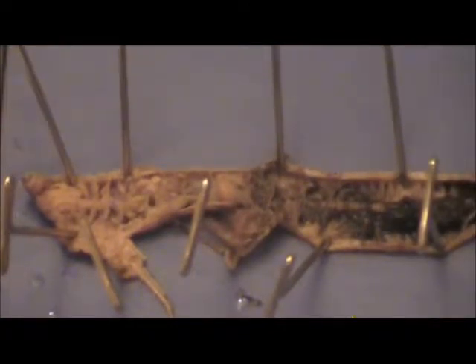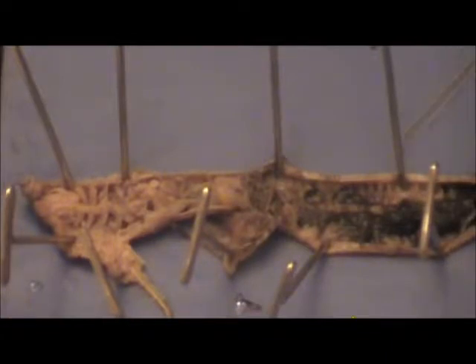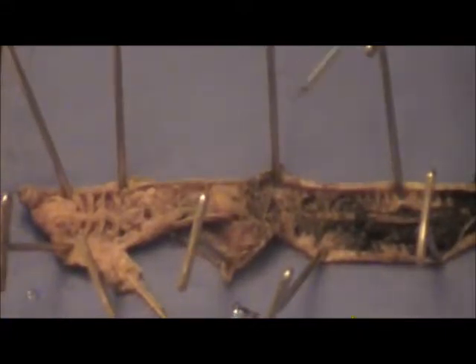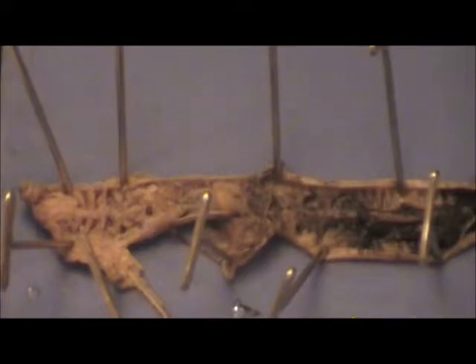So the oxygen, worms have no lungs or gills or anything. So all the oxygen is absorbed through the skin, and this goes into the dorsal blood vessel, which hopefully you can see here. I'm pretty sure that's it. Wait, no, this is the intestine. So you can't see the blood vessel right now, but it runs the length of the body. You can see it through the skin in most places. And oxygen is absorbed into this blood vessel, which goes into the hearts up here, and it's pumped to the organs. And a worm's heart beats 12 to 18 beats per minute. So it beats once and then it returns to the body. It returns to the hearts, and it's pumped again.